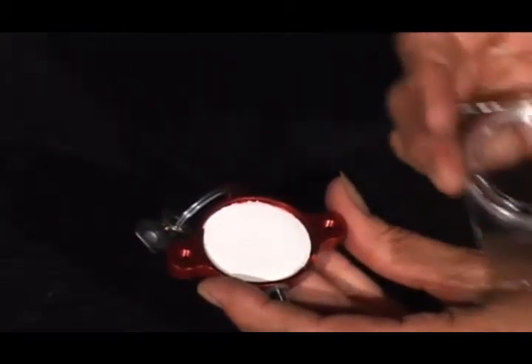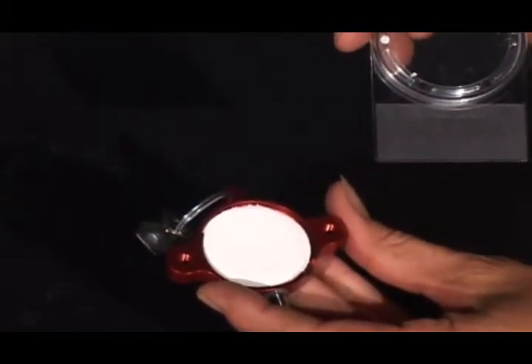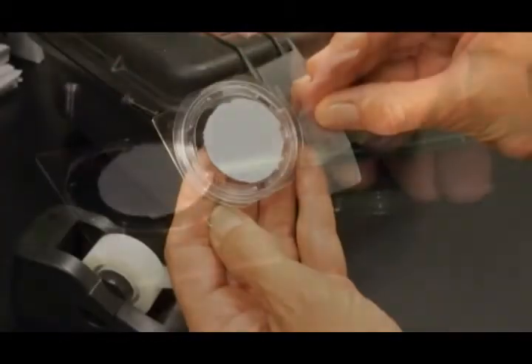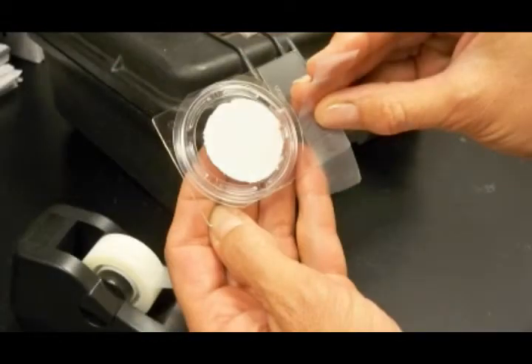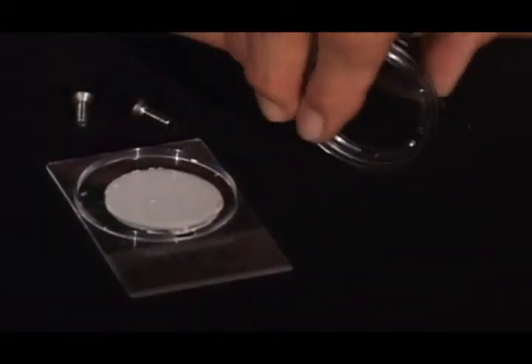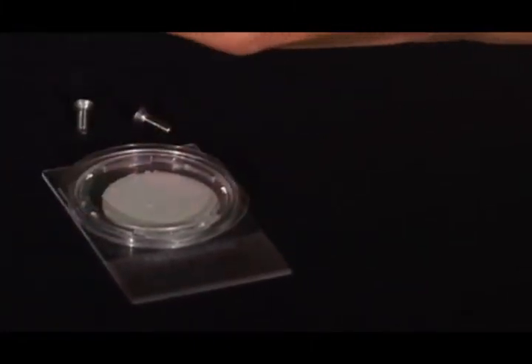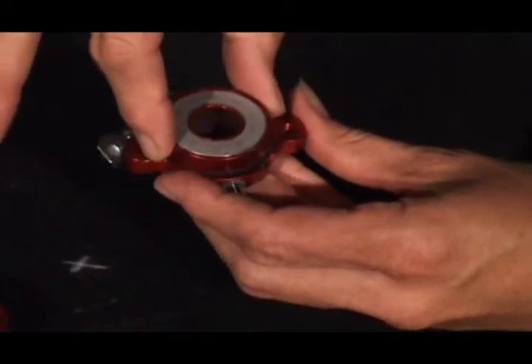Lift the filter out gently and place it in your open Petri slide. Only touch the edge of the filter. Put the plastic cover on the slide and tape it down with clear tape to keep it secure. Tape over your writing on the slide as well so valuable information does not get rubbed off. Place the slide in a baggie in a freezer to keep it cold. You are now free to clean the PEM as before and re-oil it.